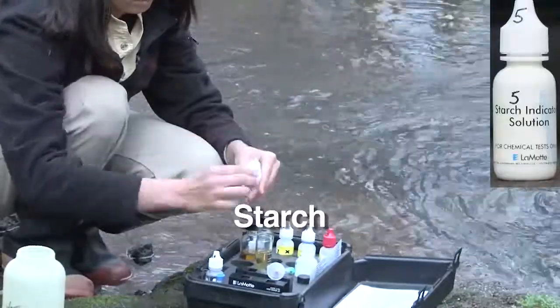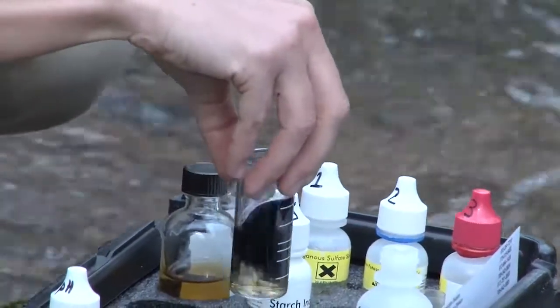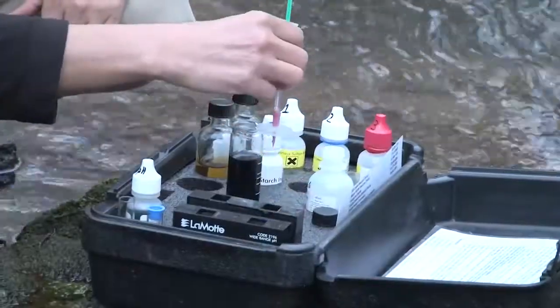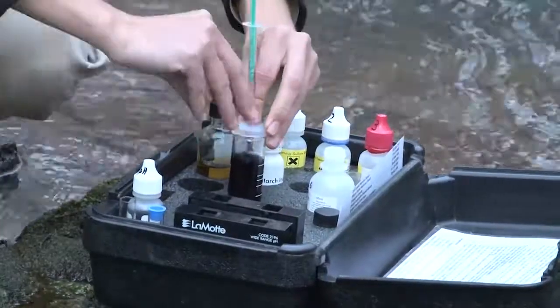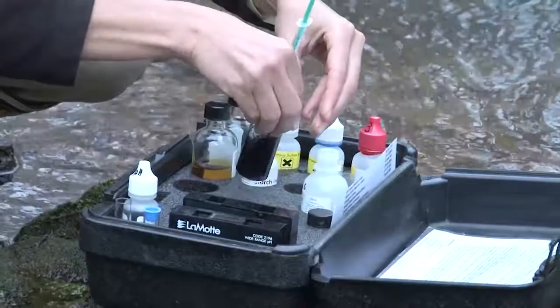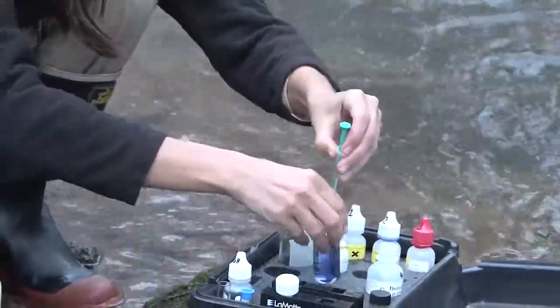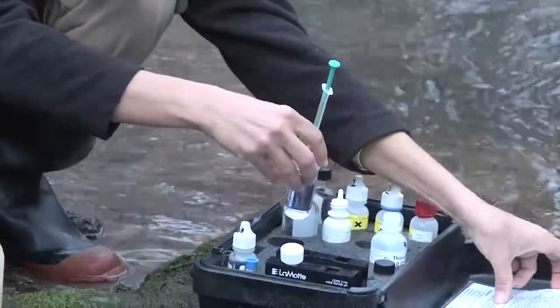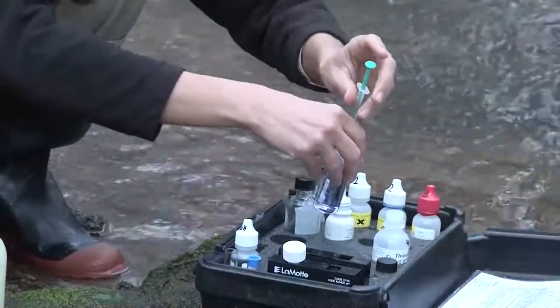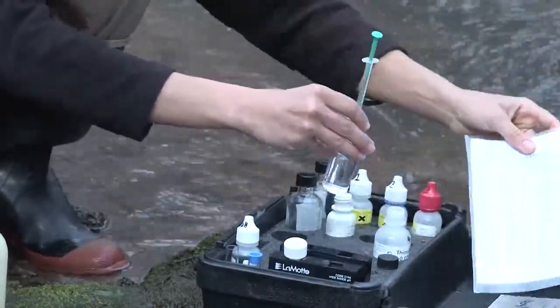Tara shakes the starch indicator solution and then adds eight drops to the vial. The solution turns a dark blue. Now she reattaches the cap and continues adding the remaining sodium thiosulfate solution, one drop at a time, until the solution becomes clear. She swirls the vial after each drop to help the mixing. The solution gets lighter and lighter. She compares the color against a white background — you might use your sampling direction sheet. If you don't have the pink tip for your titrator, be very careful, as it is easy to add too many drops near the end and get a false high reading. Now it's clear, and she's reached the end point.